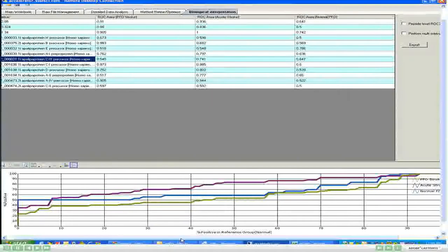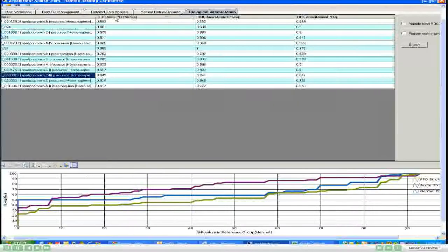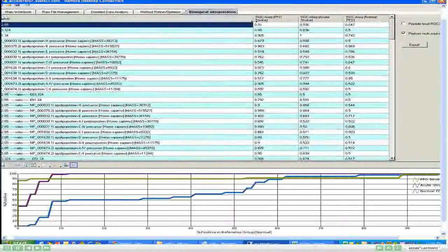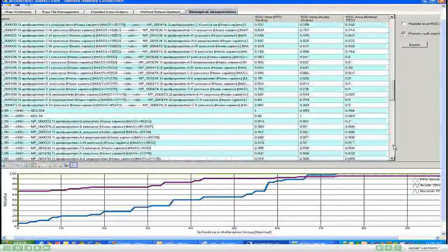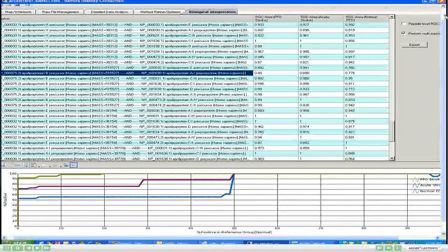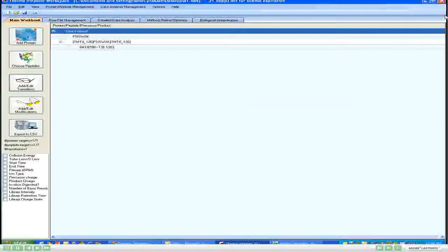We can click on this and see what's going on. It's a little noisy file. Click change area, click on that, and this peak profile gets corrected. So that's the benefit of looking at this particular view. But once we have such a large data set that is split into multiple samples, control, case.